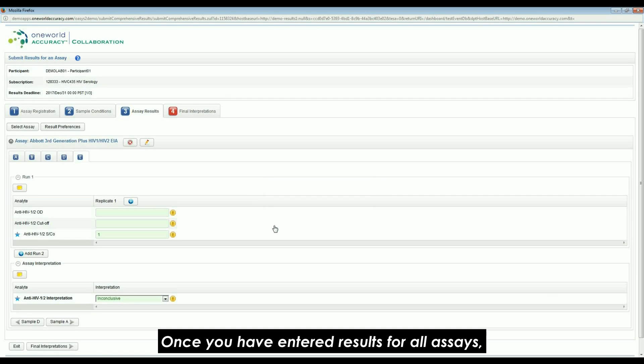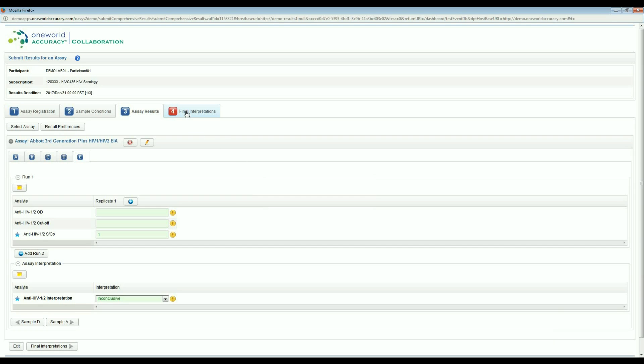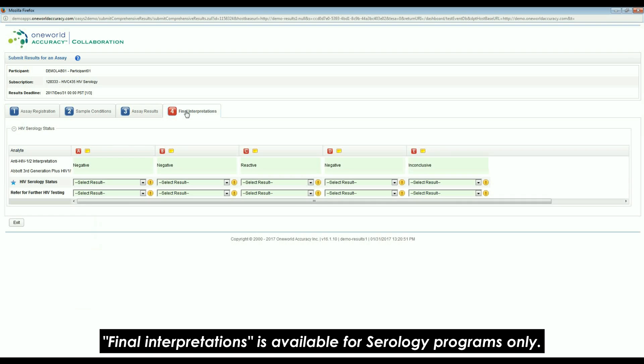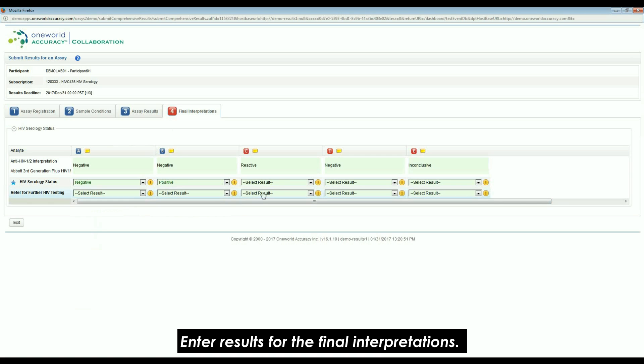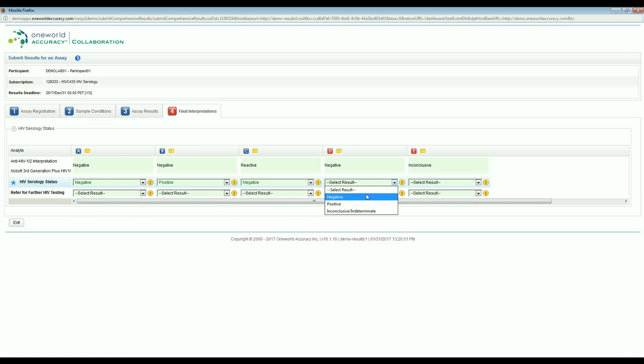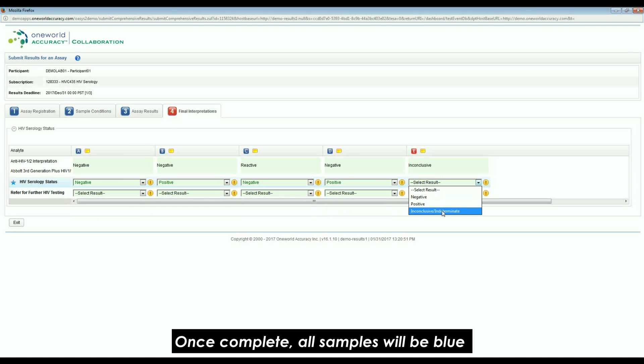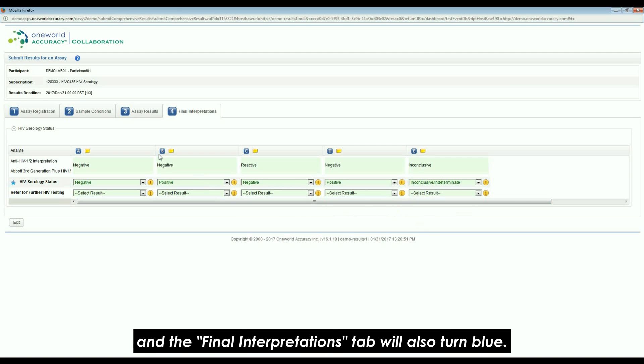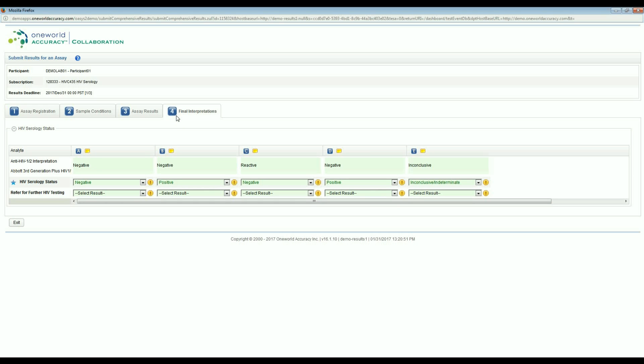Once you have entered results for all assays, if there are final interpretations available for the program, click on the Final Interpretations tab to continue. Final Interpretations is available for serology programs only. Enter results for the final interpretations. Once complete, all samples will be blue and the Final Interpretations tab will also turn blue. You are then finished and may exit.